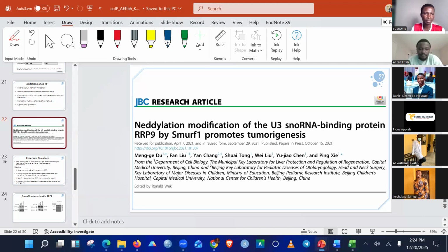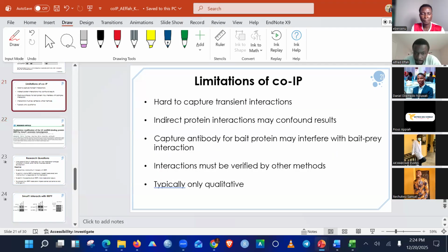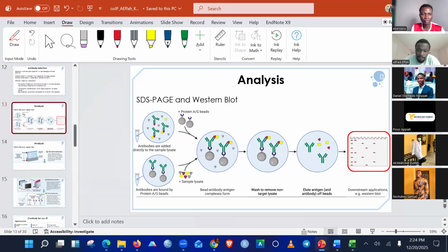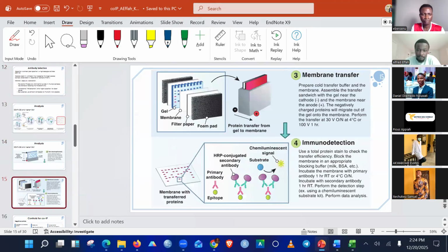You're welcome. And then last one, sorry, with your protein A and X. After we've passed the gel through a membrane, we say that we would have to add an antibody that reacts specifically with protein X, so that we can confirm the presence of protein X. So I was asking myself, why the headache to go through all the process if you have an antibody that can react straight away with protein X, and then you go away with it, but you have to pass through all the process before you capture protein X at the end?